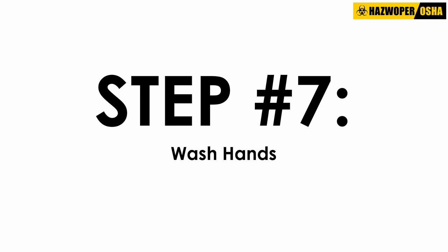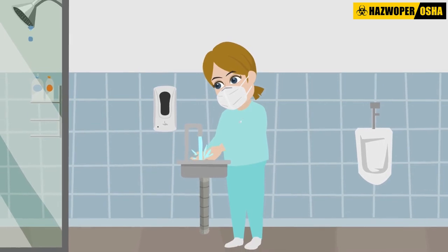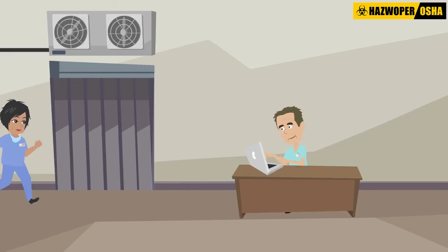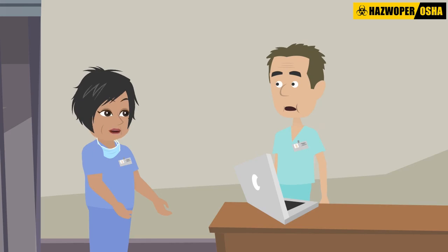Step 7: Wash hands. Once the spill cleanup is complete, wash hands thoroughly with soap and water. Step 8: Reporting. It is important to remember that the incident should be reported to the supervisor as soon as feasible.